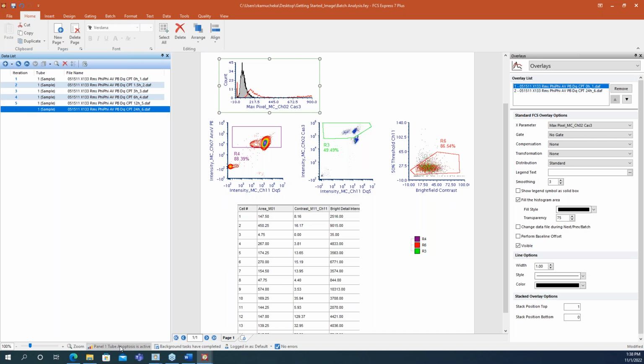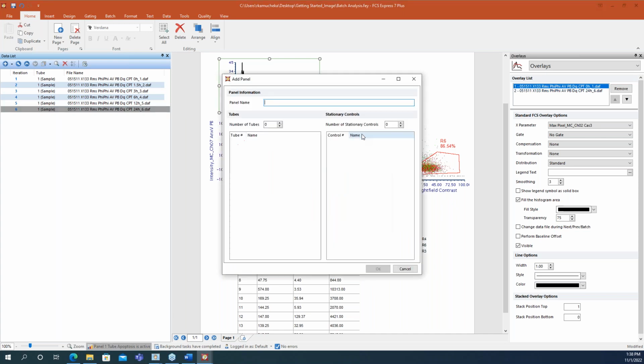With our panels, we have updated our panels. So we have some awesome new ways to control your samples as well. So if maybe a couple of these samples were collected on an AMNIS to gather different parameters, I can tell the software, I want to use 3 of these samples in different places through the layout and create the ability to look at 3 different samples in 3 different spaces. Maybe I was looking at a certain cell type in tube 1, a second one in 2 and 3, with the same fluors, or whatever that experimental design is, I have some flexibility.